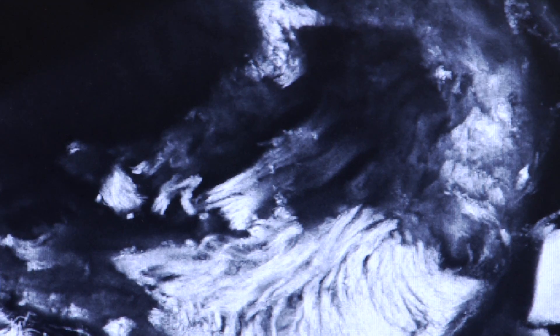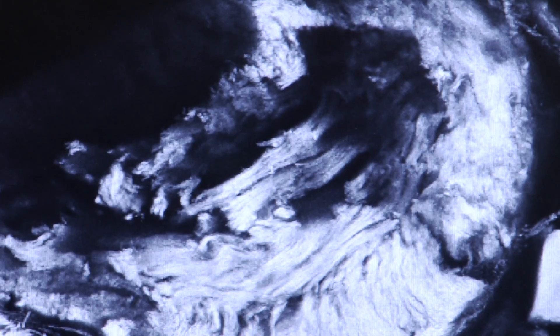You're also able to optically slice through a sample, which you can reconstruct to produce three-dimensional images — just something you couldn't see with any of the conventional microscopes. And that's what makes Confocal so good.